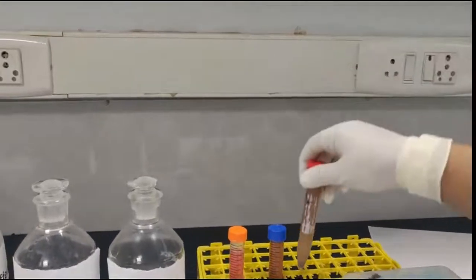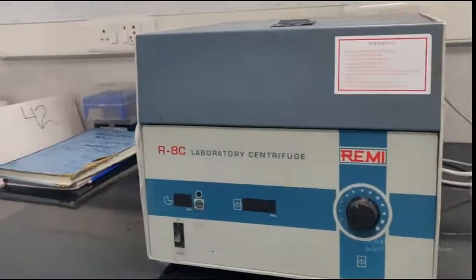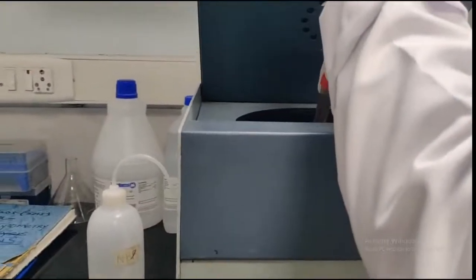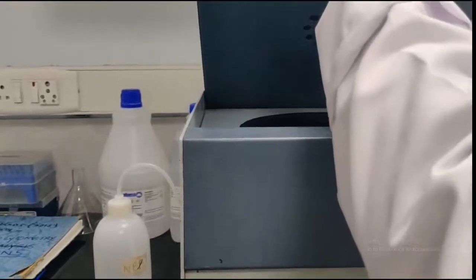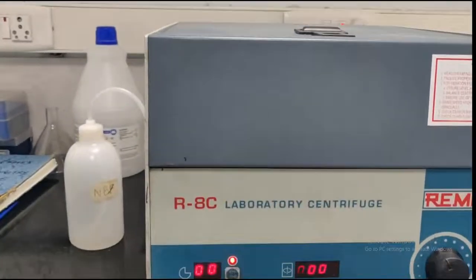Now both of these samples will be centrifuged. So the centrifugation will be done in this desktop or tabletop centrifuge, and the speed will be 1500 revolutions per minute for 10 minutes or 3000 revolutions per minute for 5 minutes.